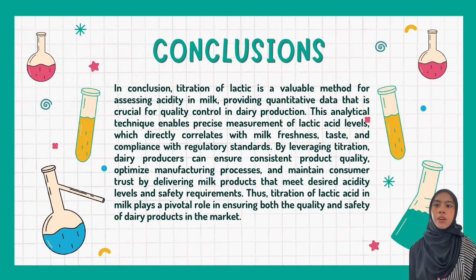In conclusion, titration of lactic acid is a valuable method for assessing acidity in milk, providing quantitative data that is crucial for quality control in dairy production. This analytical technique enables a precise measurement of lactic acid levels, which directly correlates with milk freshness, taste, and compliance with regulatory standards. By leveraging titration, dairy producers can ensure consistent product quality, optimize manufacturing processes, and maintain consumer trust by delivering milk products that meet desired acidity levels and safety requirements. Thus, titration of lactic acid in milk plays a pivotal role in ensuring both the quality and safety of dairy products in the market.